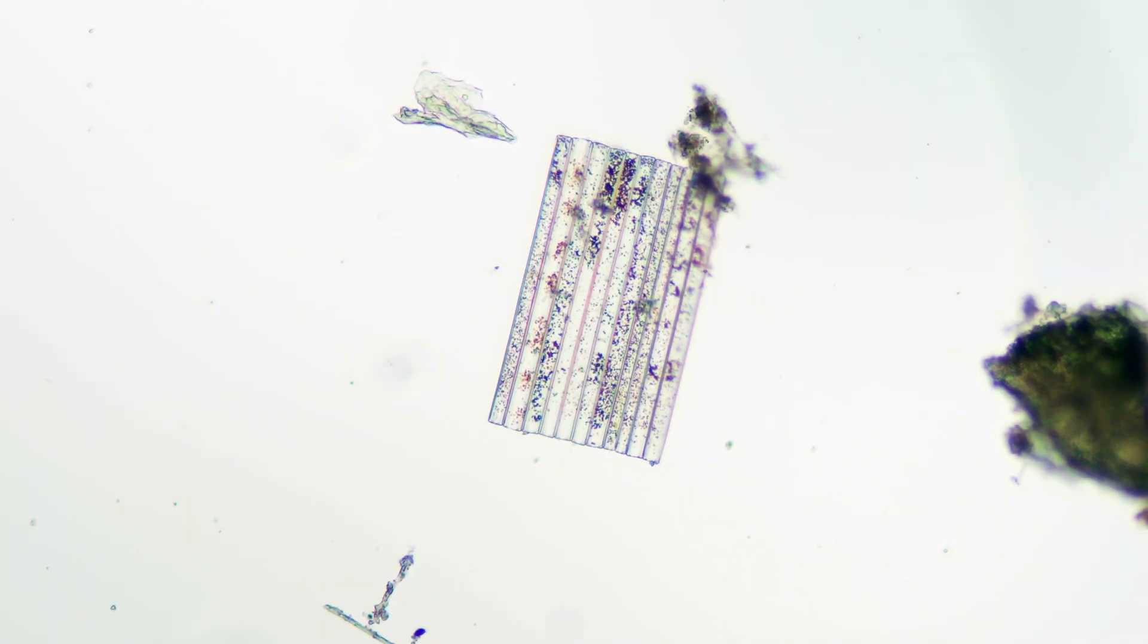Now check it out again. Same magnification, but something changed. Let's zoom in.